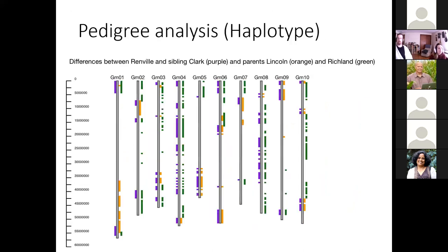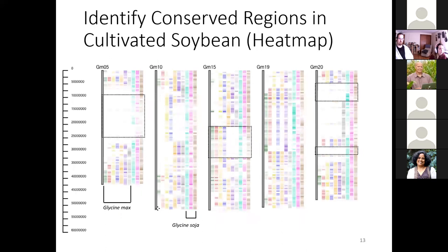On chromosome 11, there are very few differences between the Andean line and the Mesoamerican lines, but quite a few differences between the Andean reference and the other Andean lines. This indicates a probable introgression from the Mesoamerican population on that chromosome.